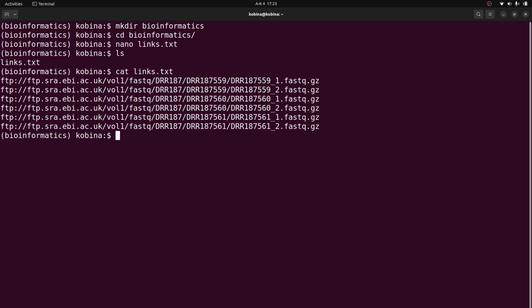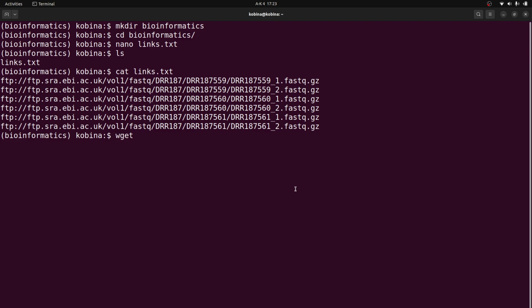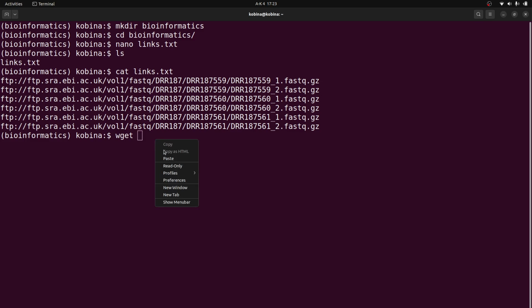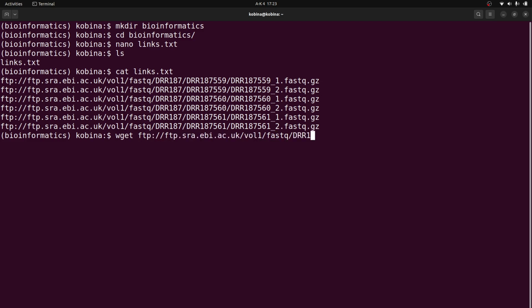All right, there are different approaches to download them. Because I'm using Linux, I will just do a batch download using xargs, but you can also just use wget and specify each of these links. If you have any challenge, you can just use wget or curl and then specify the links one by one, like this one here, and then just hit your enter key to download. But I'm going to do a batch download, so I don't need this approach.